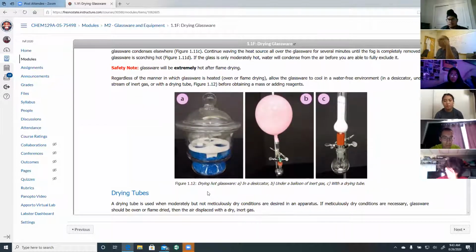I'll figure it out. And this is a balloon. Sometimes you run a reaction using a gas. You might be using hydrogen gas. We often do this. We can use a balloon filled with hydrogen gas, and this fills up the flask with hydrogen gas. And now the compounds in the liquid inside this round bottom flask get to mix with hydrogen gas and react. You can make an alkene into an alkane or alkyne into an alkene using hydrogen gas.